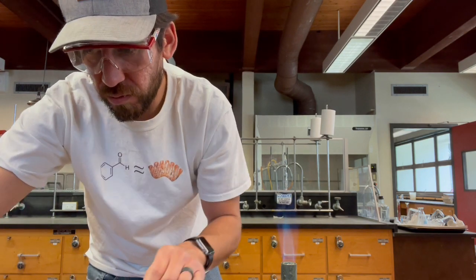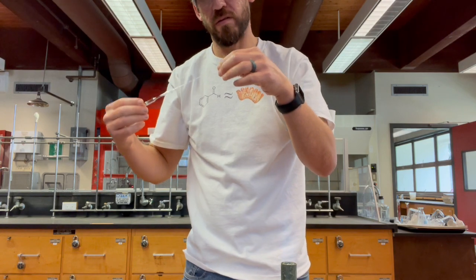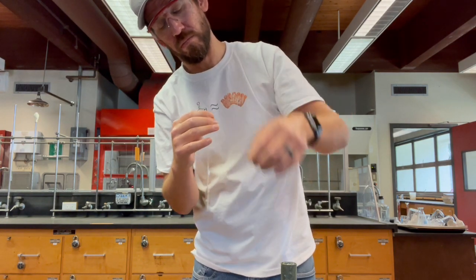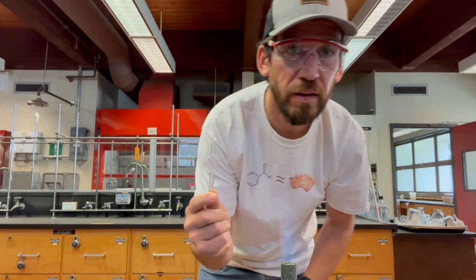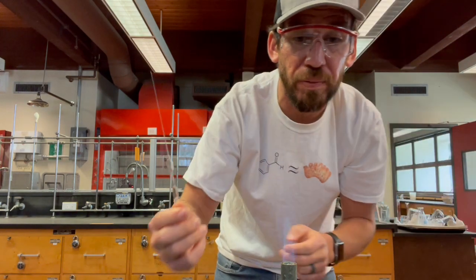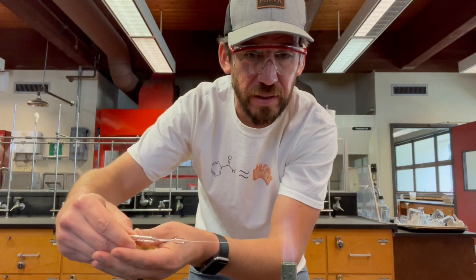But I also need to seal it. Okay, so let's see. Break that bad boy off. Okay, so now this side is open. That top part right there is open. So I'm going to carefully place this barely inside the flame down below.